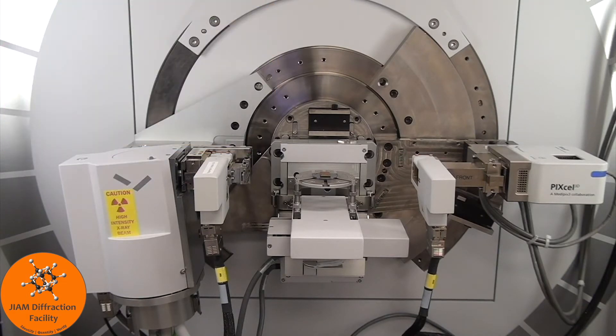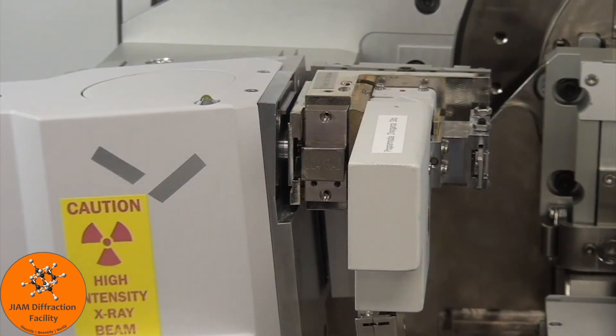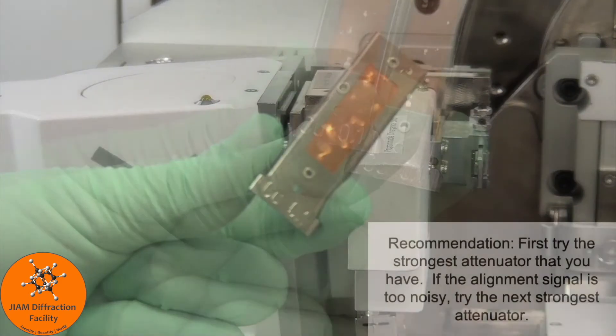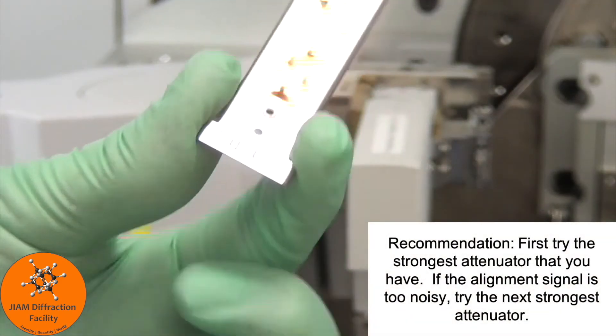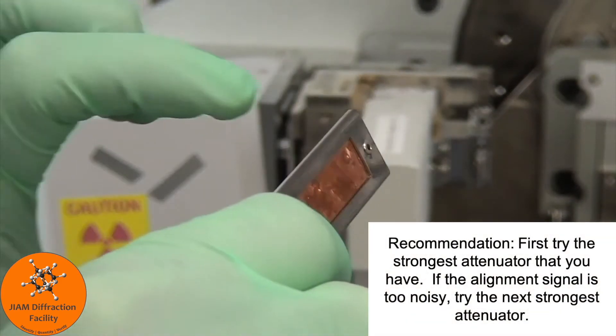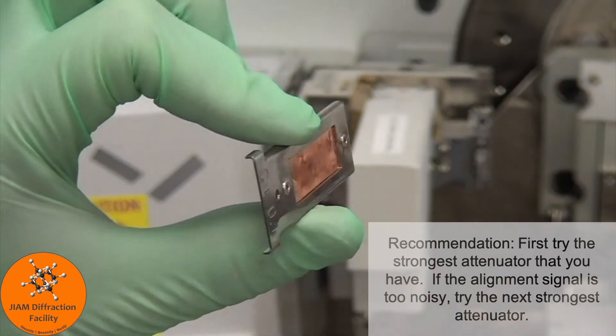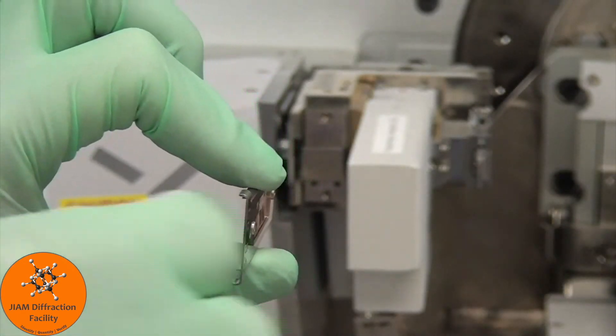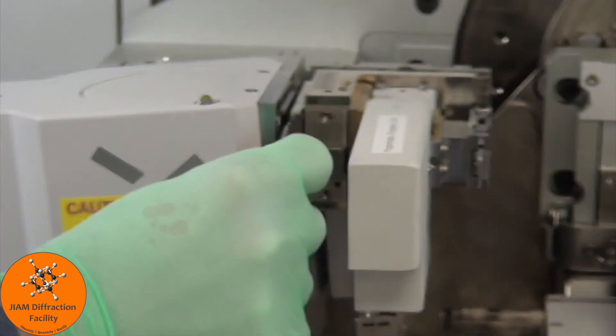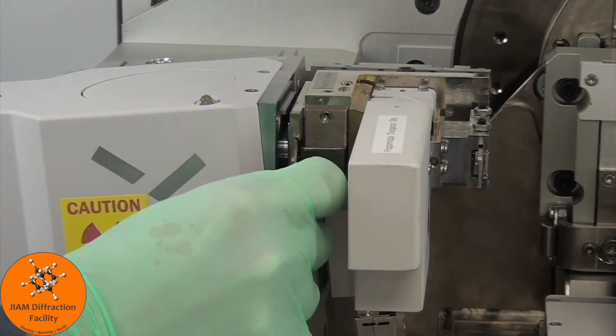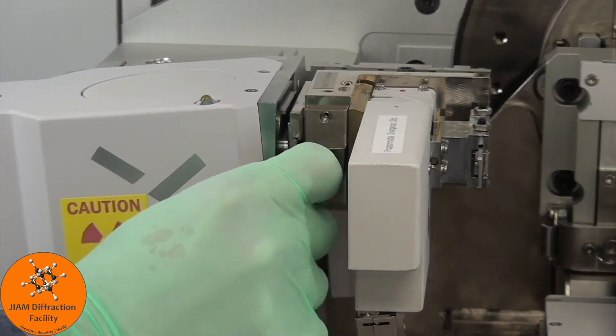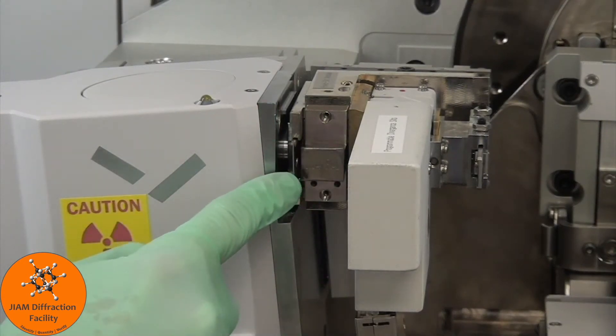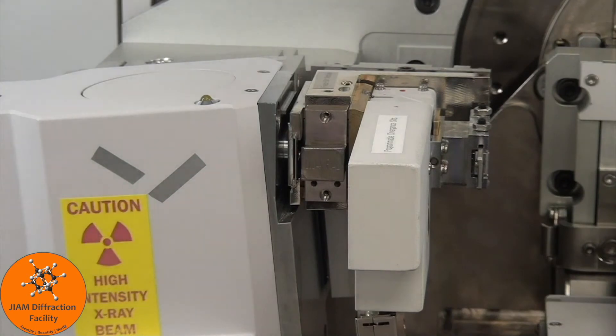Here we see the Empyrean system set up with the XYZ stage. In order to absorb some of those x-rays, we will use an attenuator. If we want to install the attenuator, we want to align it like this, and then place it just to the left of the solar slit. It just goes all the way in and sits there pretty loosely.